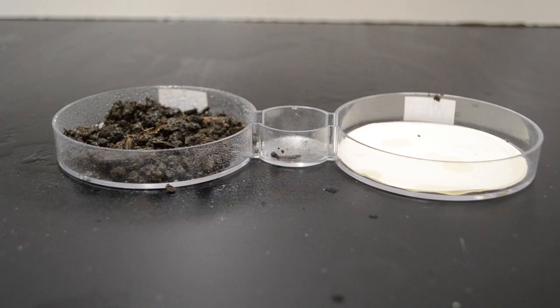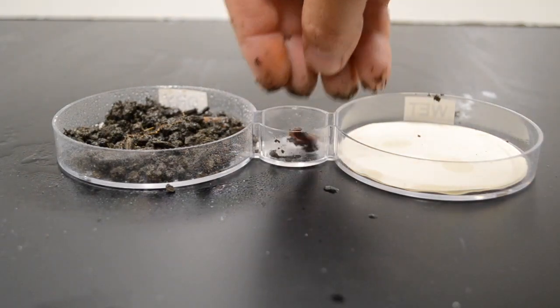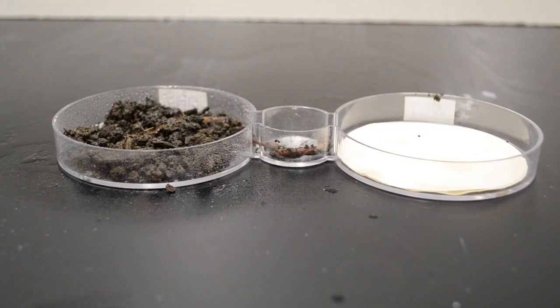And now I'm going to get that same worm and I'm going to put him right in the middle there, and let's see where he goes. And while this is happening, I want you to think again, what are some observations and inferences we could make? What are the variables? And then later we'll start working on what is a procedure, what is the data we could collect, and then what is a conclusion we could write. So we'll just wait for 2 minutes and see if this worm moves anywhere now.